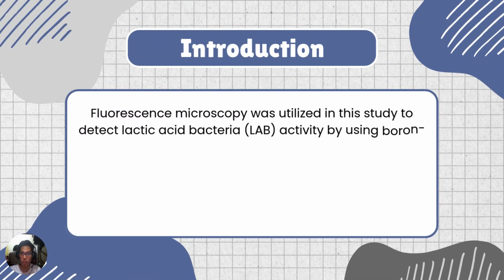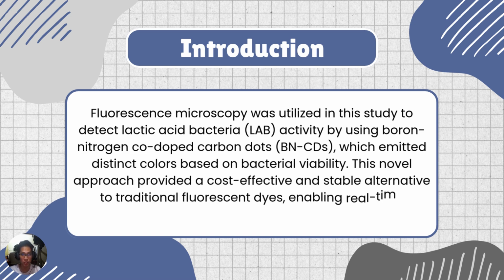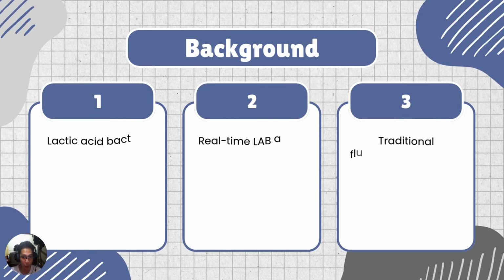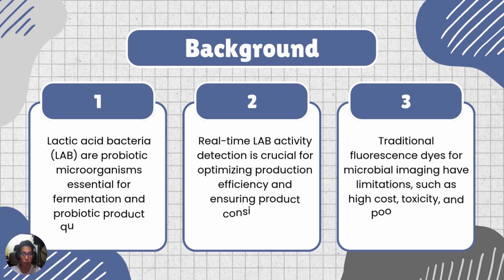This research explores an innovative fluorescence microscopy technique for detecting bacterial viability using boron-nitrogen co-doped carbon dots, or BNCDs. A quick background: lactic acid bacteria, or LAB, are widely used in food fermentation and probiotic production. Monitoring their viability is crucial for ensuring product quality and optimizing industrial processes.